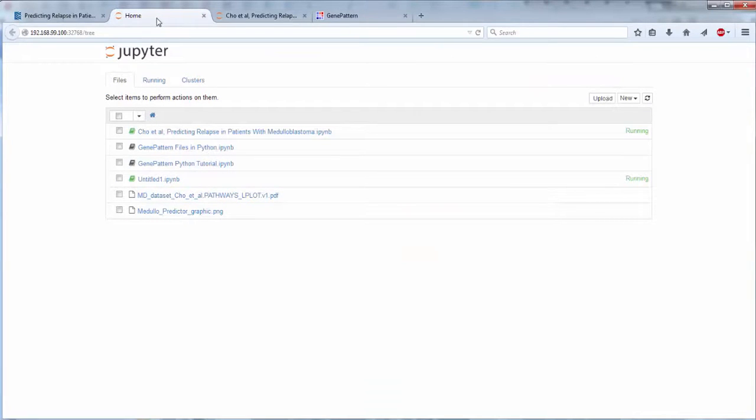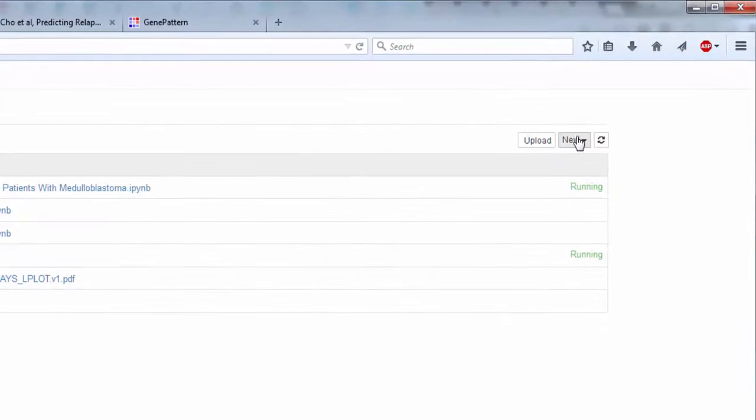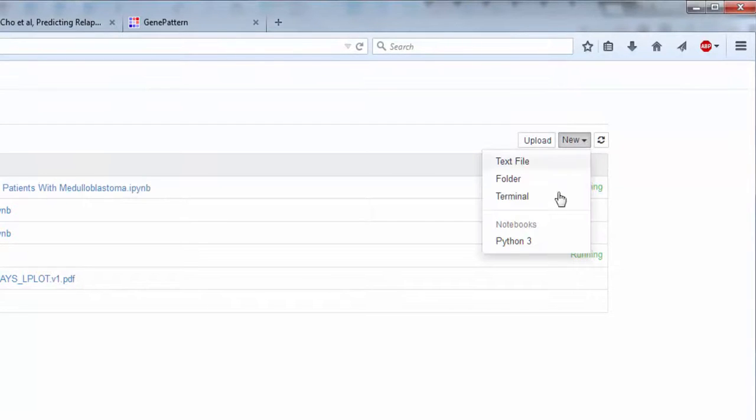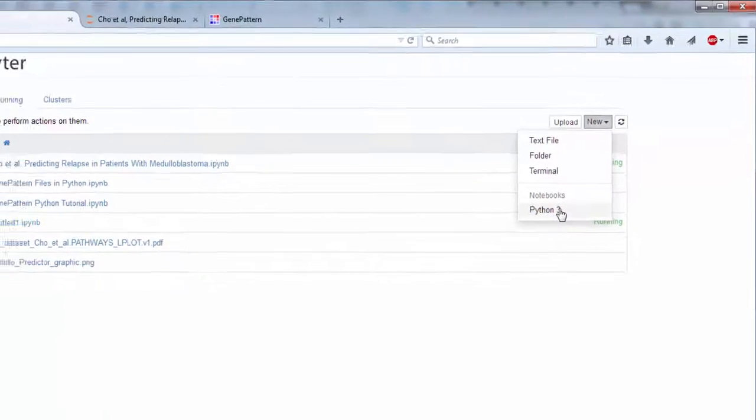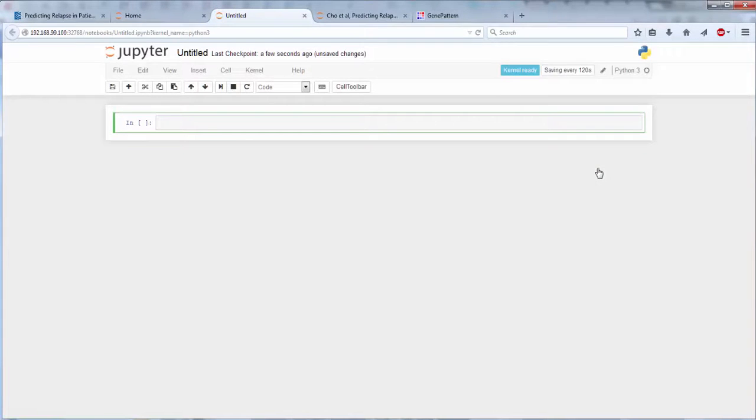From the Jupyter Notebook Environment main page, pull down the New menu and select Notebooks, and whichever version of Python you have installed. This will create a new GenePattern notebook, which will open in a new browser tab.